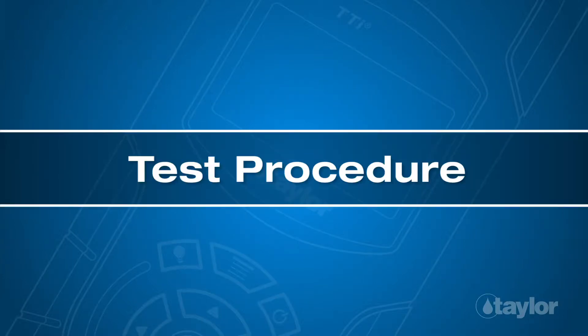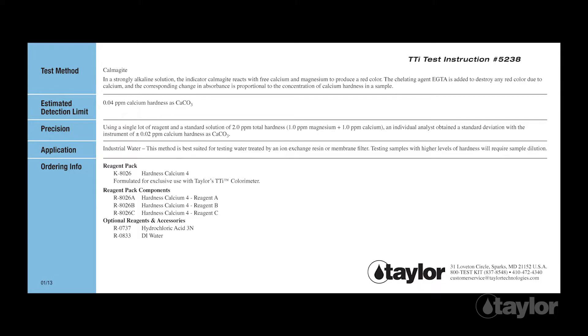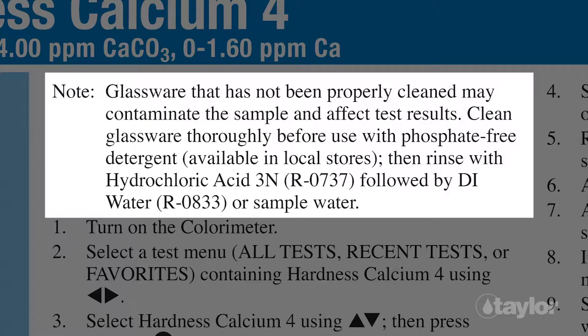Test Procedure. Before beginning this or any other Taylor test, it is best to read the instructions through to the end. Familiarizing yourself with all the steps to come is particularly important if the test is new to you or if the reagent pack is newly purchased, as sometimes our procedures change. Included within the instructions for K8026 is information about the proper way to clean the glassware used for this test. Please read and follow these directions before performing the test to assure accurate results.